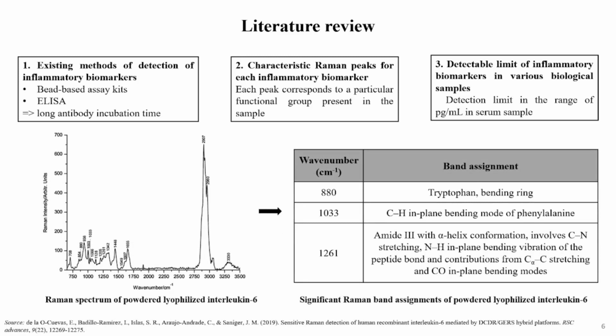Now, this is what I was explaining about. In the Raman spectrum, the example that I've mentioned here is for interleukin 6. Every peak that has been mentioned here in the literature has corresponding band assignments, just like Sarva sir mentioned.